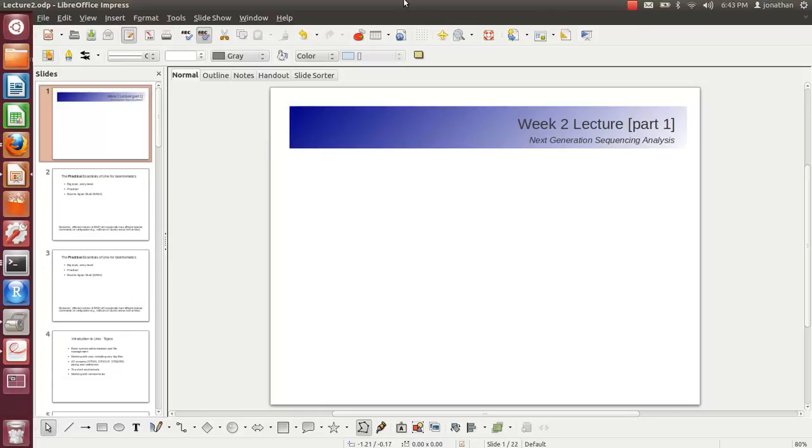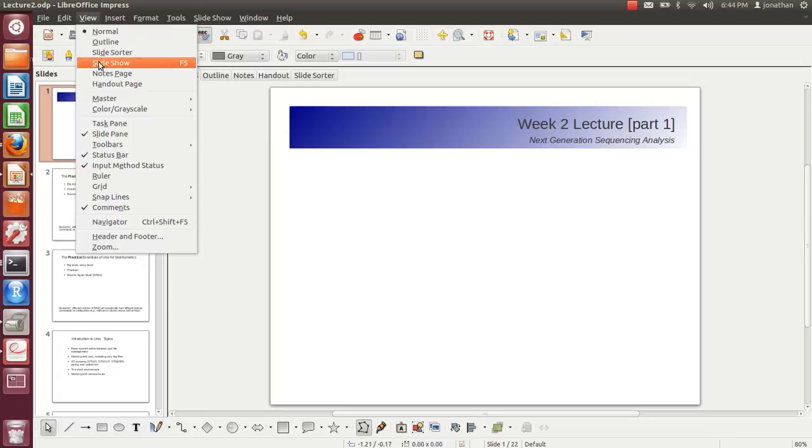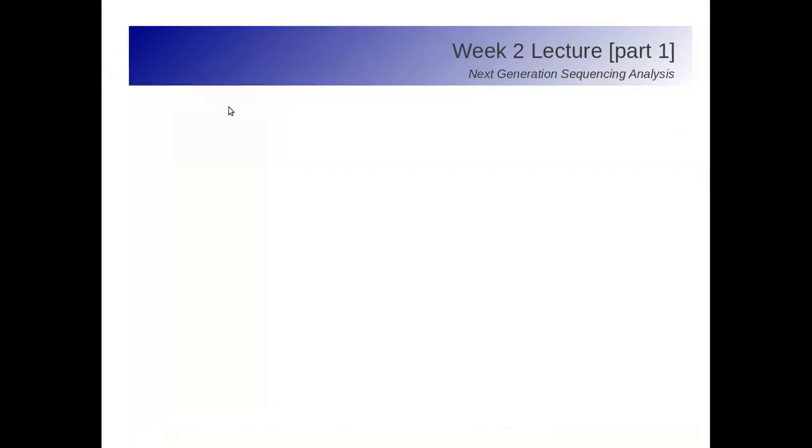So hello students, welcome to the second week of the next generation sequence analysis class. This week we're really going to start to get into some of the tools that you'll be using for the rest of your careers, and we'll get into some of the quick data analysis methods that you'll be able to use by learning how to work the Unix command line.